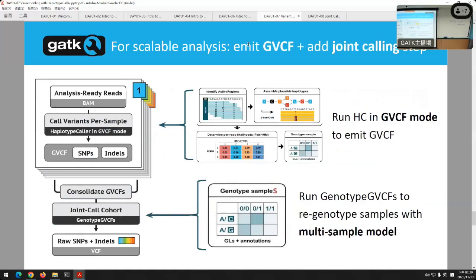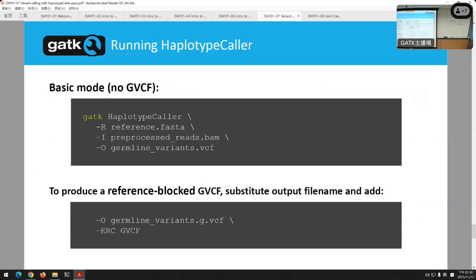So instead of a VCF file, we create something called a GVCF file. Again, Aaron will talk about that. It's most of the way over to variant calling, but not quite to the finish line, so that we can then put all the samples together in memory and determine what everything is together. To do that, we need to use a different argument, I'll show you in a second, and then run one of our joint calling modules to group all the data together and analyze them together.